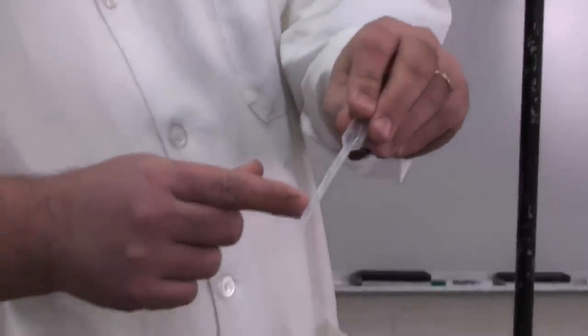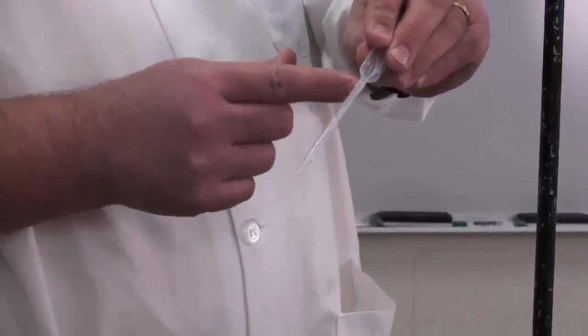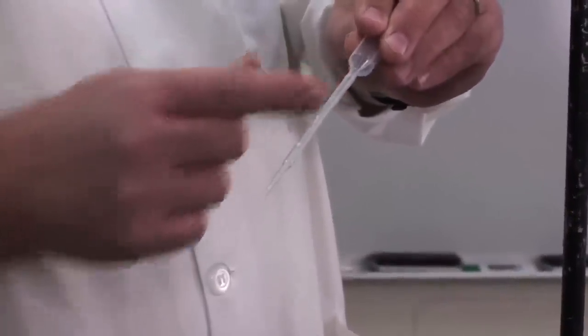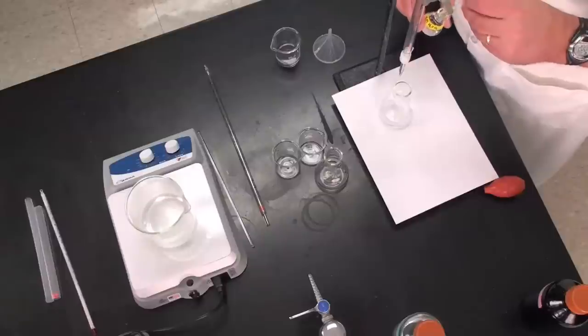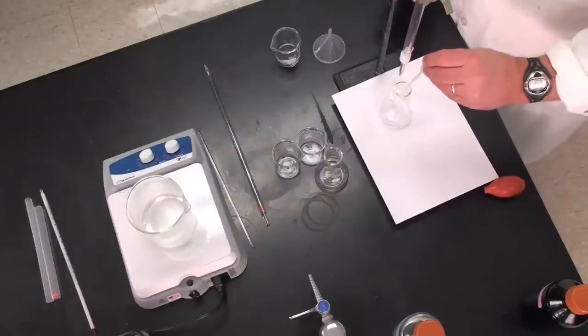It's graduated—the graduations are hard to see, but filling to the top of the neck is about 1 milliliter. So I'm going to take about 1 milliliter. Again, the amount is not critical, and I'm going to put that into my solution to provide those hydrogen ions.